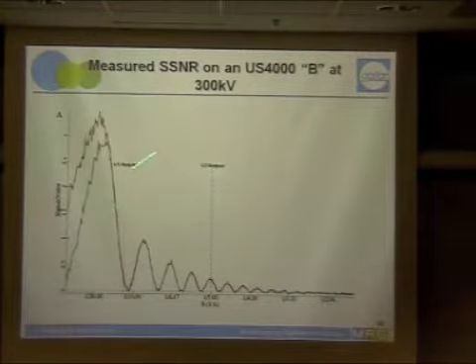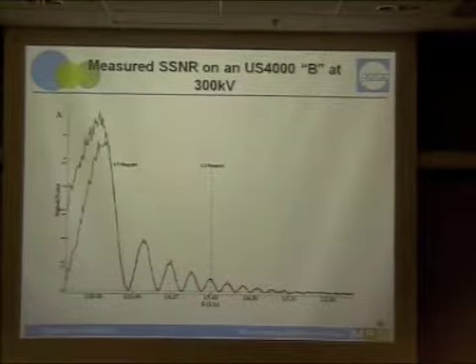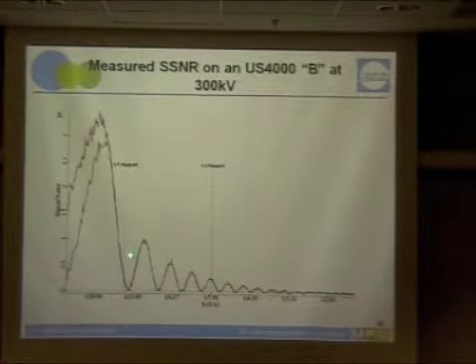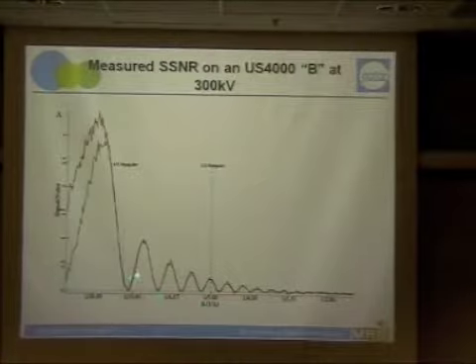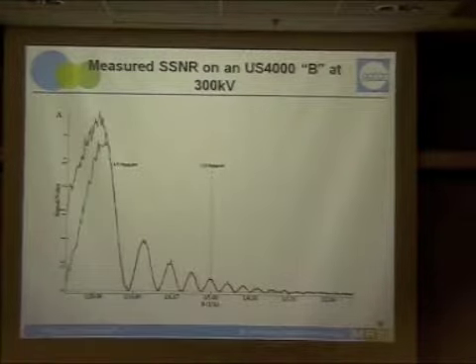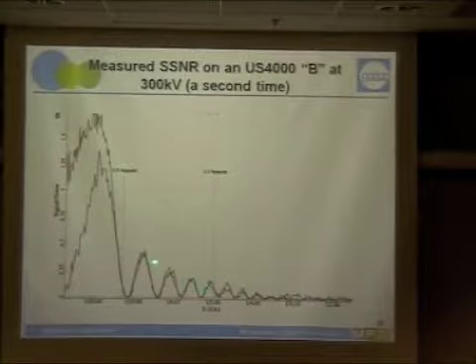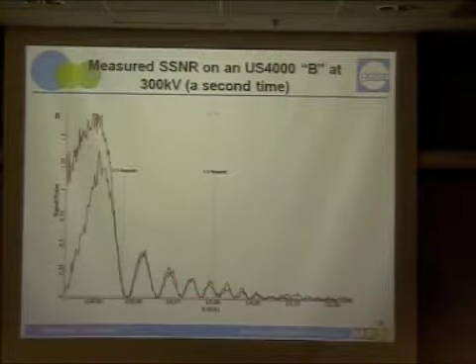So when the camera was finally made and came back to the lab, we did exactly the same kind of analysis that I described previously. And what you're looking at here, the legend seems to be gone, but red is the CCD and black is film, and we were really shocked to see that out at half Nyquist frequency and beyond, the CCD seemed to be performing as well as film. And so the first thing, we didn't believe it actually, so we did it again. And this is at a lower dose, and we saw that at higher spatial frequency, the CCD camera was really performing as well as film.